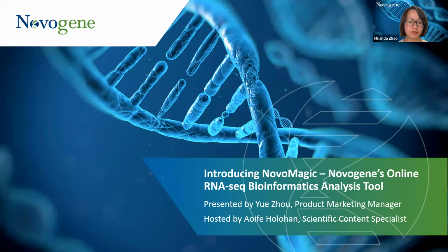Today's webinar is different to our usual beginner's guide. It will focus on Novogene's online RNA-seq bioinformatics analysis tool, NovoMagic, discuss how to navigate NovoMagic's functionalities and provide tips and tricks for its successful applications.